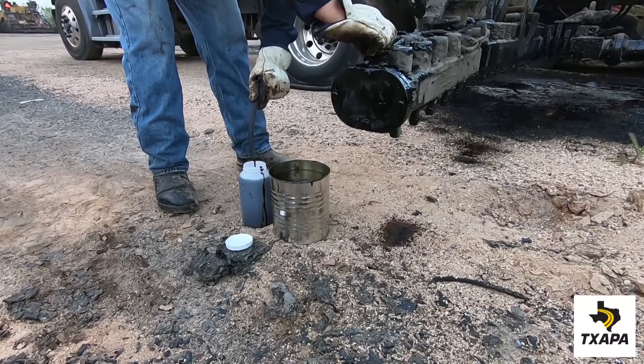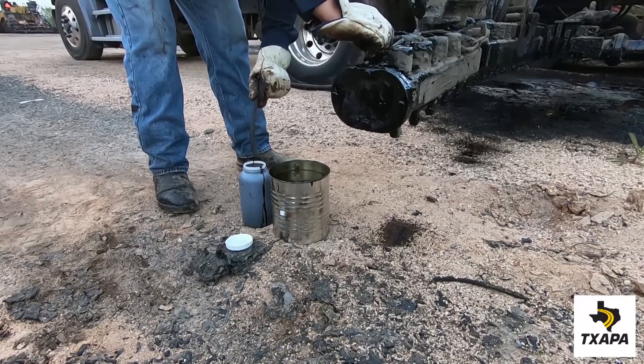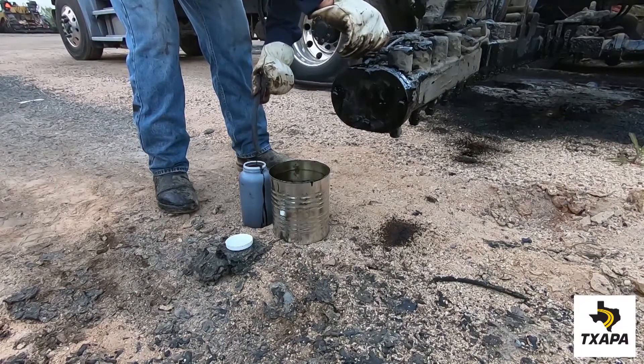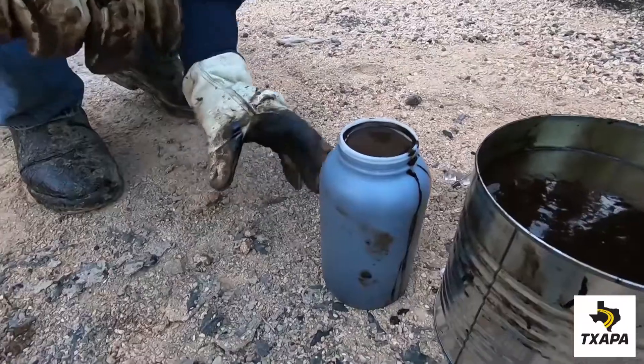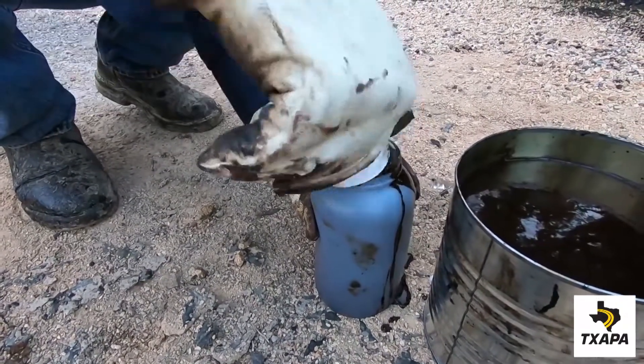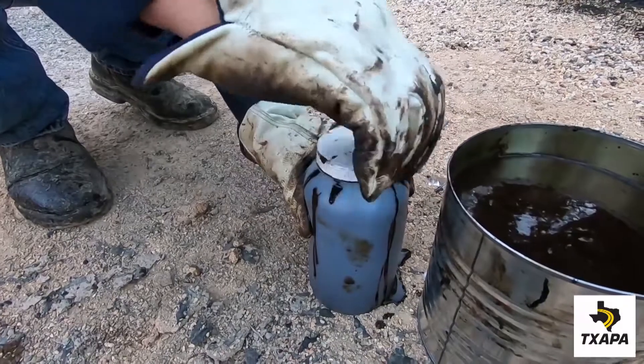open the valve and fill up the container. The goal is to get the container full. Place the lid on the container, squeeze the side of the container to bring the elevation flush to the surface and screw on tightly.